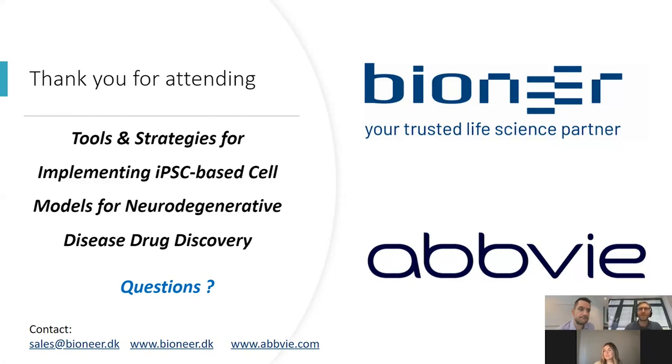Great. Yeah, so I can just chime in. And I think that what you just said is absolutely correct. I've already mentioned before that your differentiation protocol might sometimes not always work with different lines. One of the benefits of just starting with a donor you already have and you know well is that you know it's going to work most likely in your differentiation protocol.